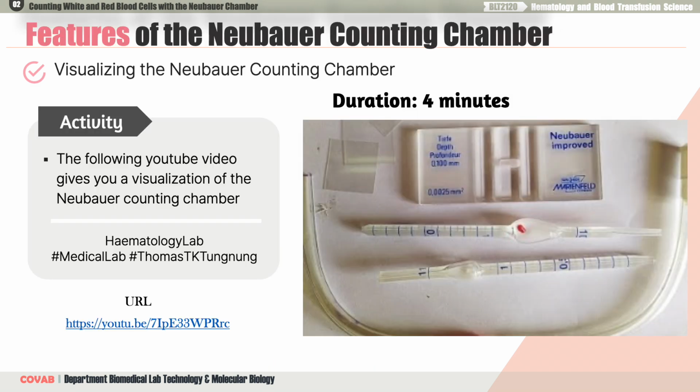I would like you to visualize the Neubaur counting chamber under the microscope. Watch the following YouTube video from Hematology Lab. The URL link is given in the video. It's a duration of about 4 minutes.